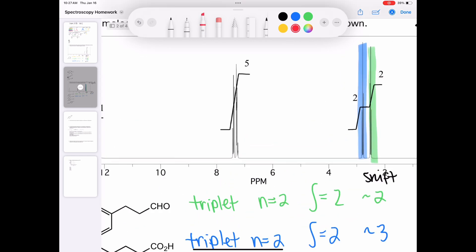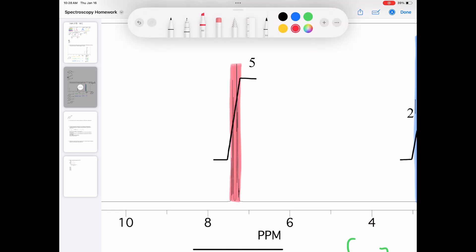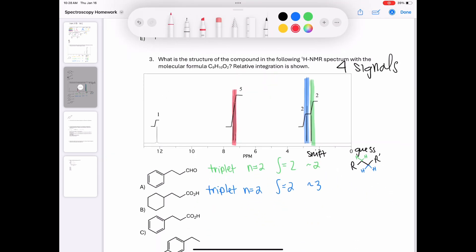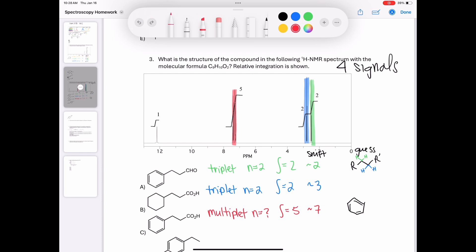The next signal is a multiplet that integrates to five with a shift around 7 parts per million. We don't know the N value because it's a multiplet, but given the integration of five and shift around 7, it seems pretty likely this is going to be a benzyl group. Because it integrates to five, the benzene ring should have only one substituent, with the other five positions being protons.